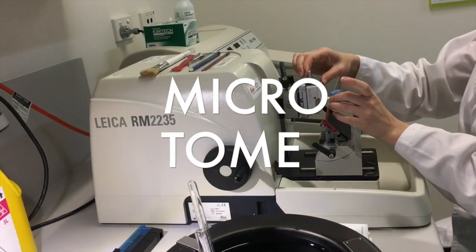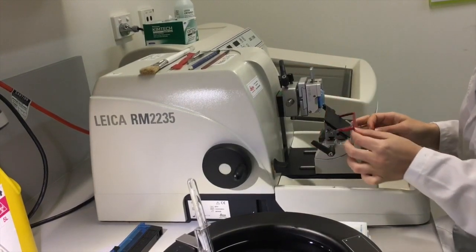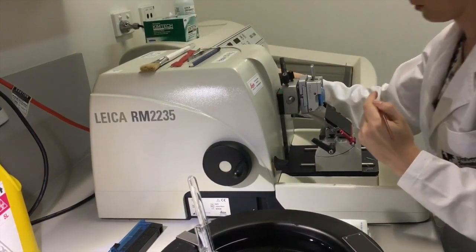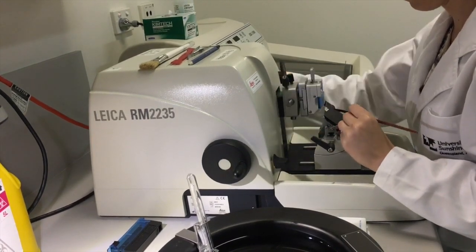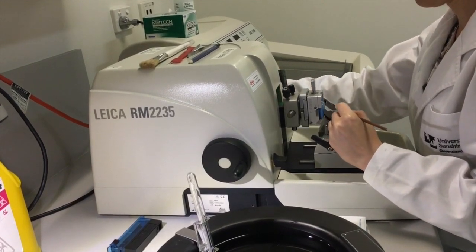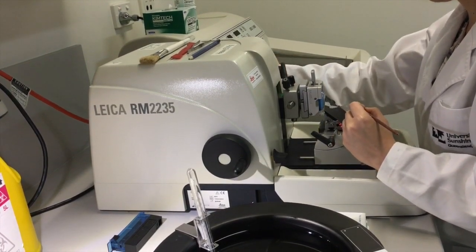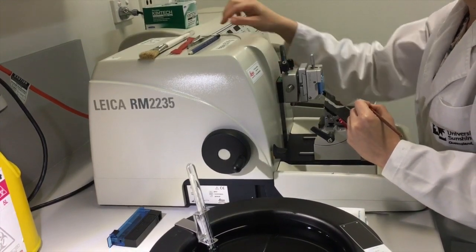The microtome is a bit like the deli slicer at the grocer's. This instrument has a very sharp knife that enables a very thin section of the tissue sample to be cut as thin as a piece of paper. It is very important to follow the safety guidelines and know how to use the roll bar and the safety lock on the microtome. The very thin sections that are cut form a ribbon of approximately 4 to 5 sections of tissue. These sections can be floated out onto the water bath.